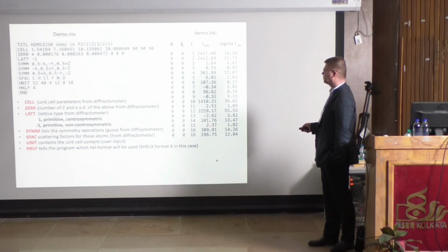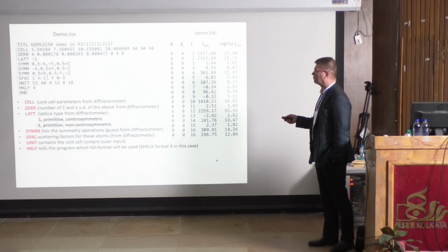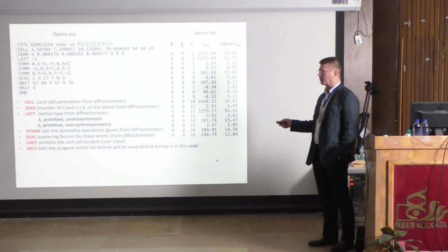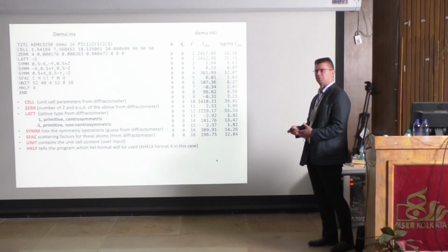It seems that this 0, L equals an odd, is missing completely. And this is the information the program has seen, and based on that, it considers that the symmetry operations inside that unit cell are those. So the data contains information.